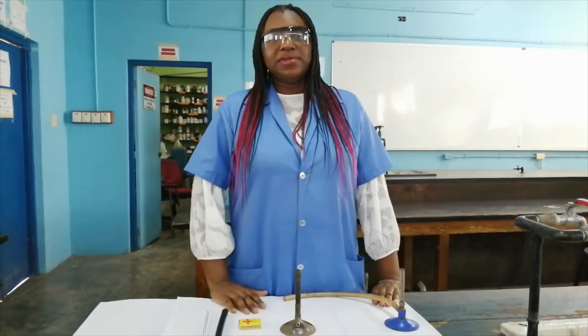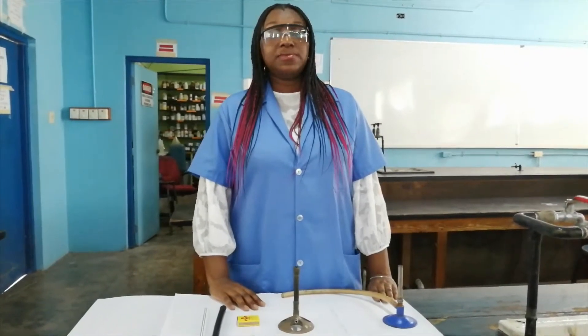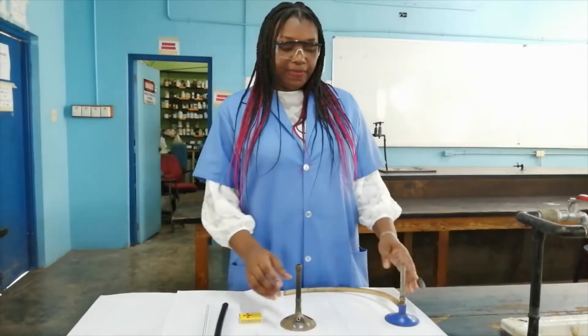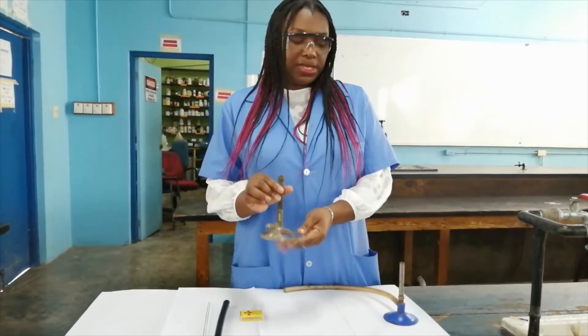Hello everyone, I'm your chemistry teacher Mrs. C. Williams Massey and today we will be learning how to light the Bunsen burner properly. In front of me are two different types of Bunsen burners. This is the more common one that is used in the lab.